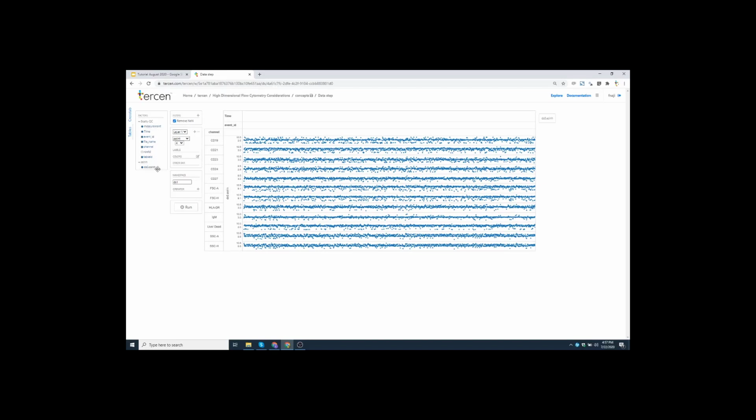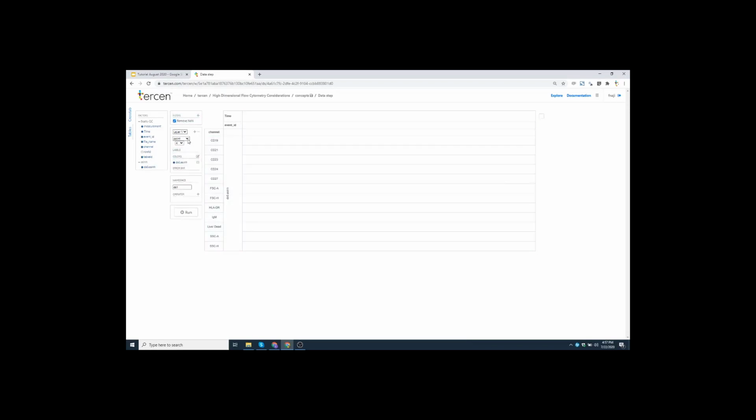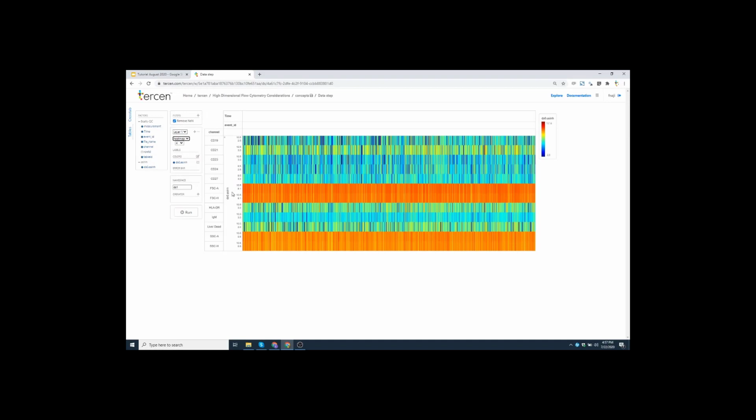And if I make a heat map based on these transformed values, using a heat map again, you see that the actual scale has changed. It's still strong. These forward scatters and side scatters are still dominant in terms of magnitude and signal, but you see that the y-axis, before it was in thousands, and now it's in tens. See it here.